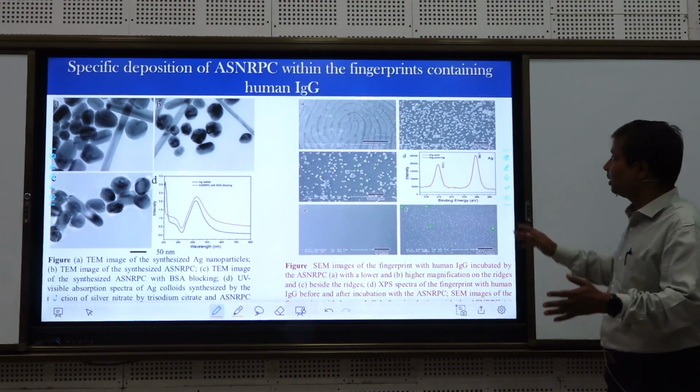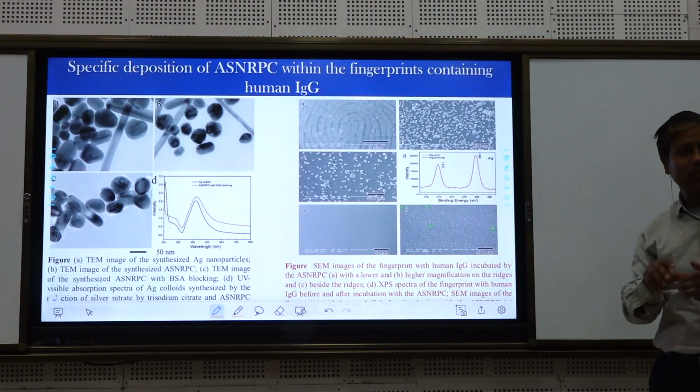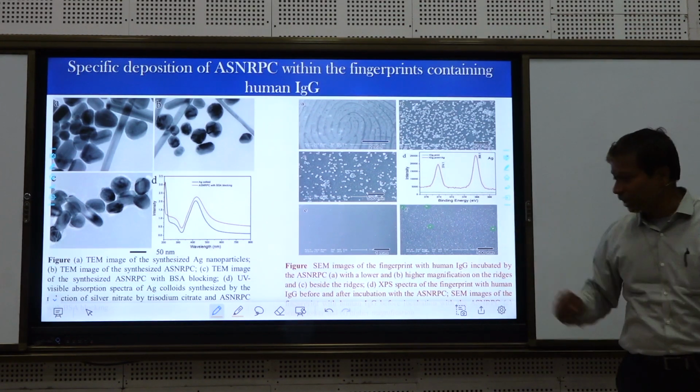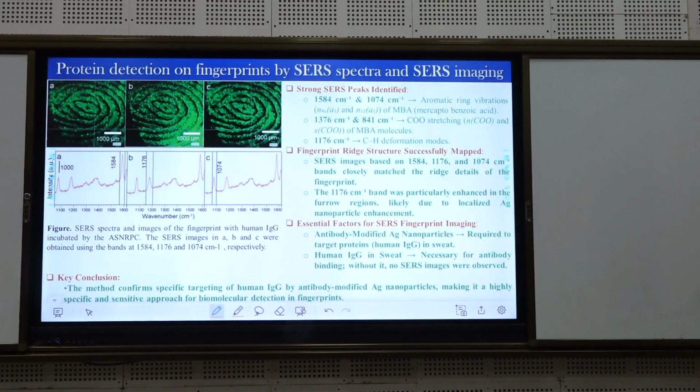What I wanted to tell you is that through this technique, they are trying to find out the information on protein, because the explosive will be in touch with the protein. So unless you deduct the protein contribution, you cannot find out the true explosive's Raman spectrum. So that is the same one.